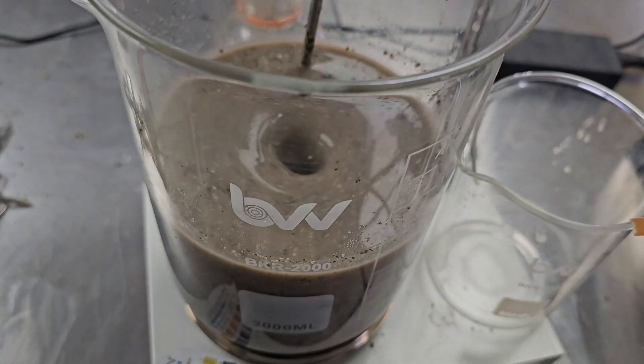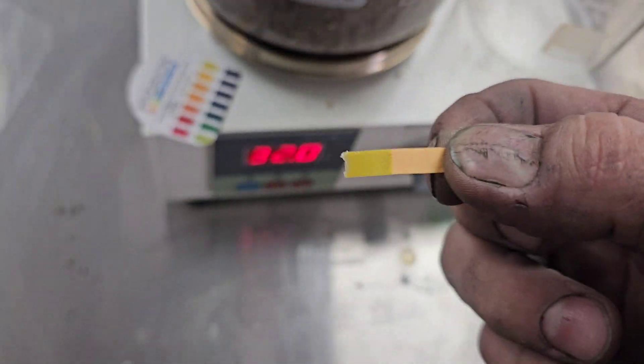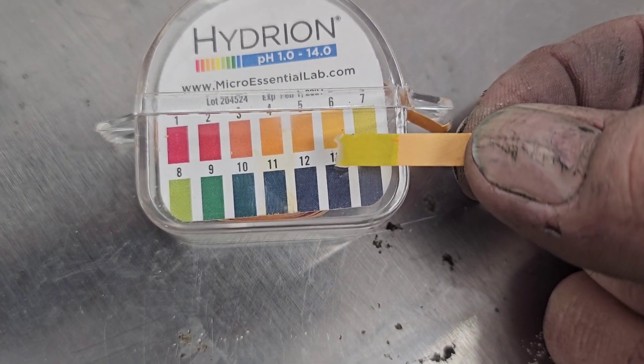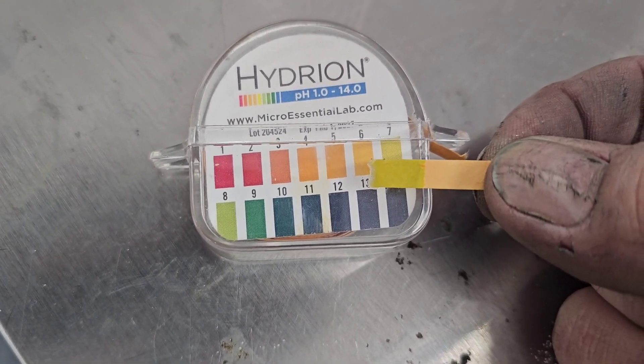We're just going to check the pH here and see if it's dropped. We started at 8, and now we're going to see where we are — quick strip test. Looks like we are right there at about 7. pH is 7.5 — that means it is dropping, that means the enzyme is working. We're going to let it continue to do its thing; I think we've got about two more hours on it and then we'll be ready for filtration.